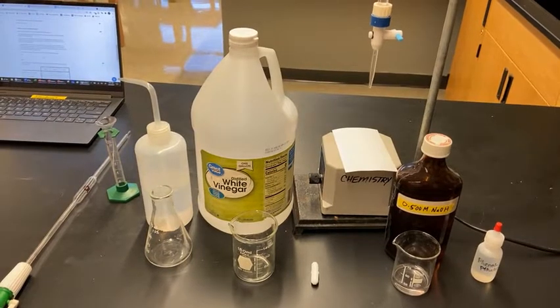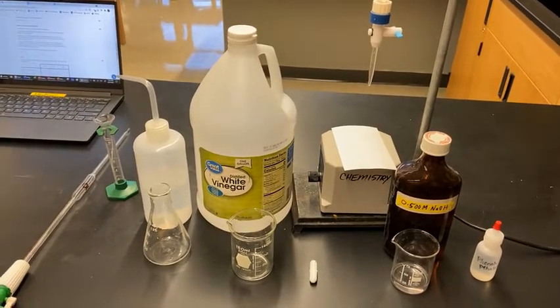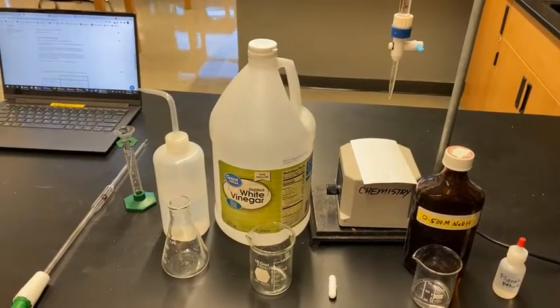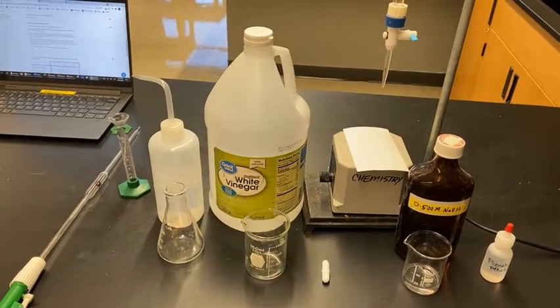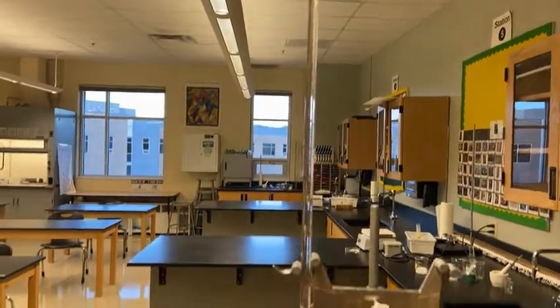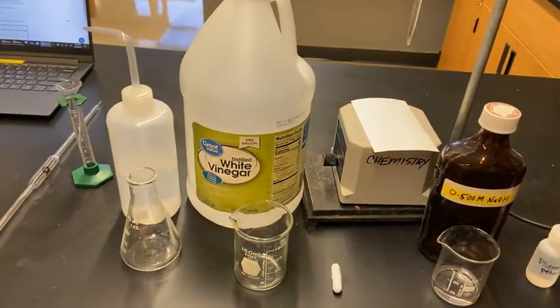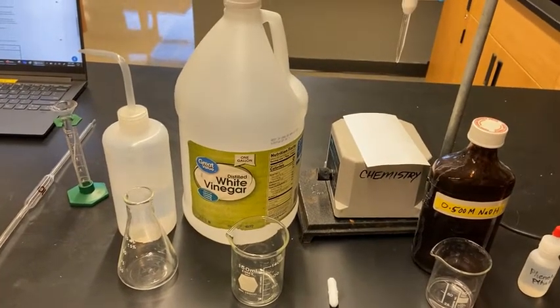We're going to do a titration together so you'll get a really good sense of how it works. I'll be holding the camera with one hand. You can see all the equipment here. I have already cleaned and filled the burette with the sodium hydroxide solution — the standard solution — and our goal today is to figure out the molarity of acetic acid in white vinegar.